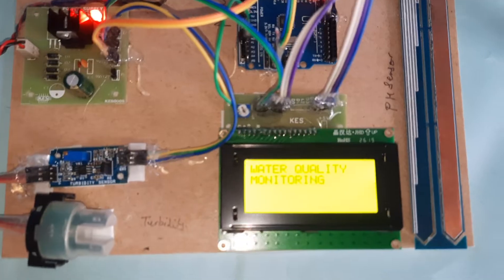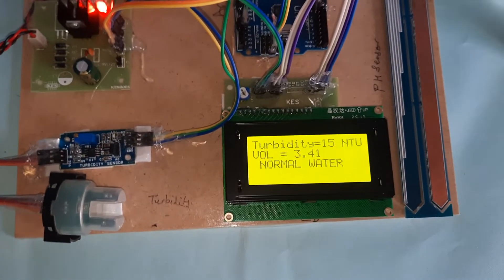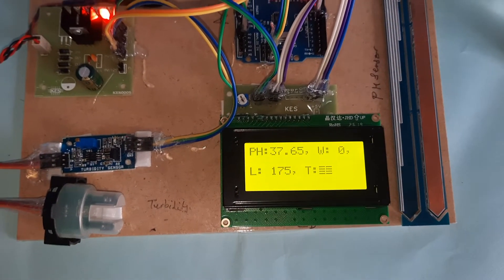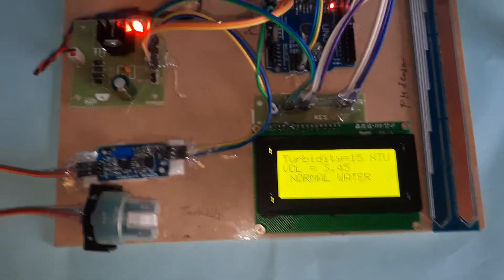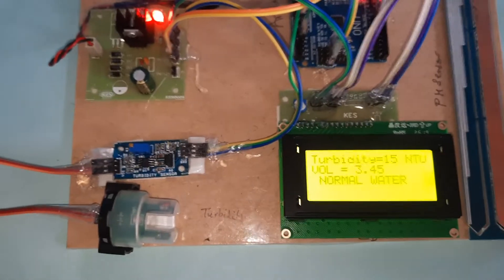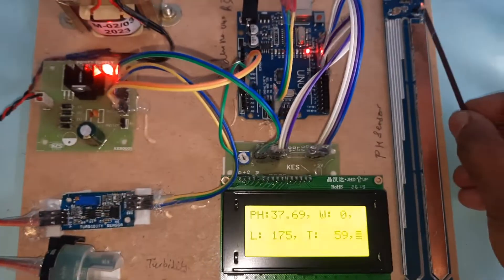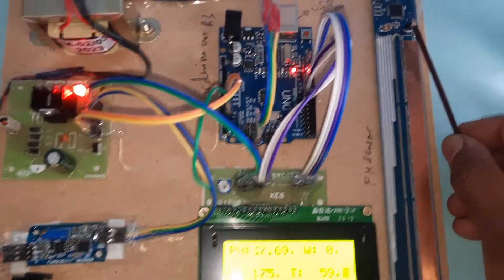Water quality monitoring system: turbidity, pH, water quality, temperature. Now I am increasing the temperature. Okay, temperature is increased.